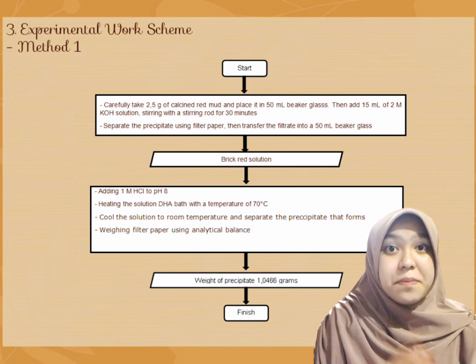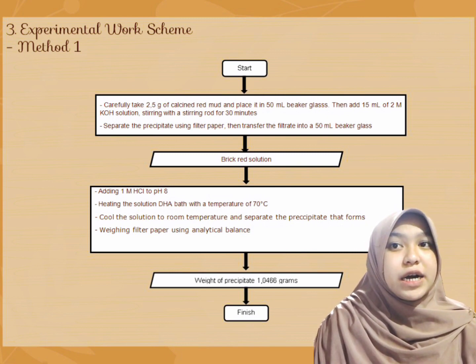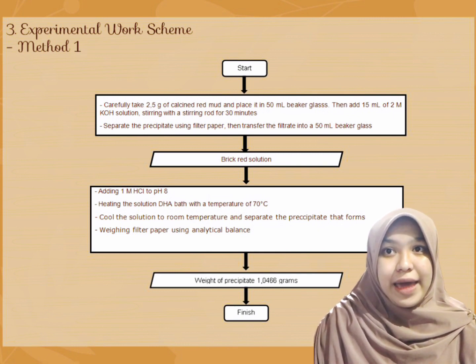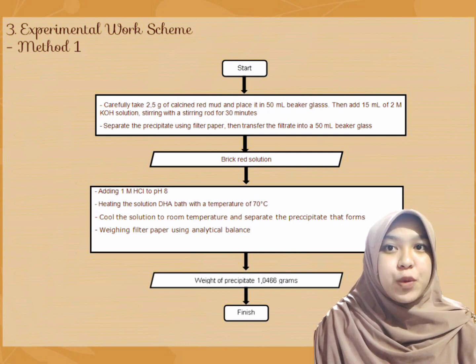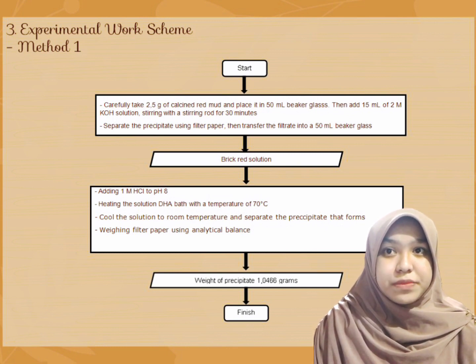Next, add 1 molar HCl to pH 8, and then heat the solution at a temperature of 70 degrees Celsius.